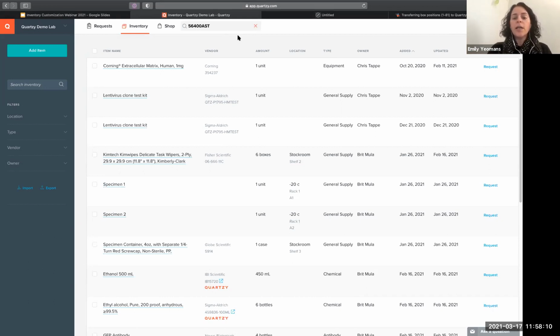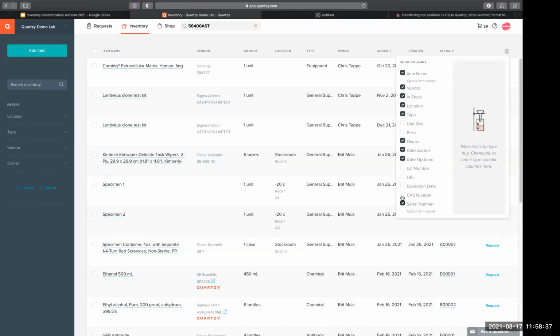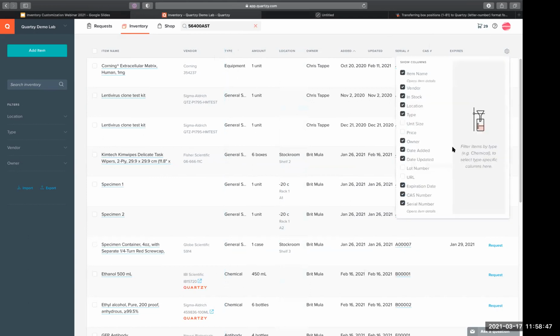There was a question earlier. We'll just take one or two more questions since we're running to the end, guys. There was a question about whether we're planning on expanding the screen view so that people can see more fields in one view. Yeah, so you can definitely add as many of these as you would like. They get very small. Yeah, they'll just get a little bit smaller. You can reorder them and everything like that. So you can really customize it.